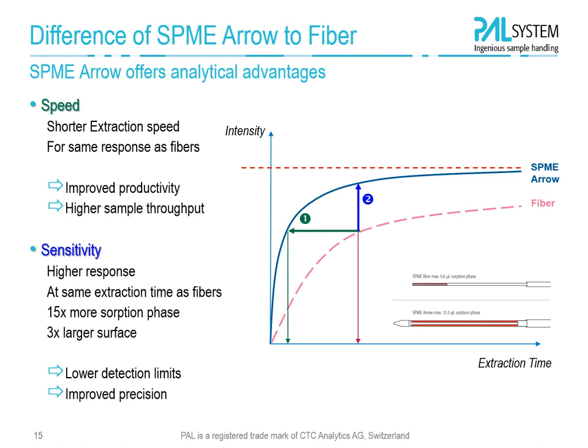For quantification, this is beneficial as we get an improved precision. In practice, a combination of both is used with the arrow, shorter extraction times for higher signal intensity.